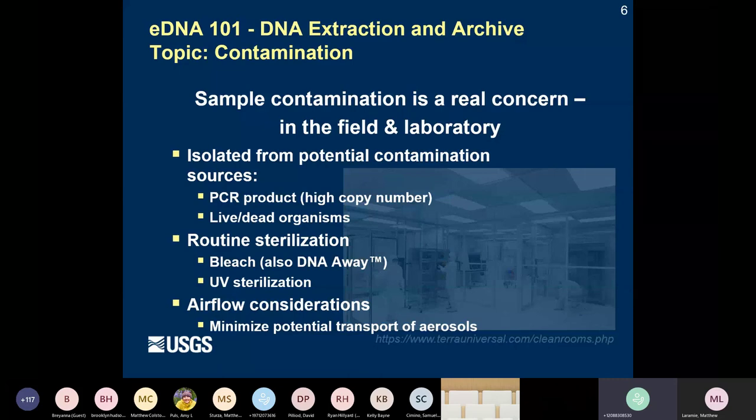So if your study is involving fish, I'm not going to recommend that this work be carried out in some lab space you might have available in a fish pathology lab where you're going to routinely handle these target organisms, or in a facility that houses both a hatchery and a lab. Those are both going to be far from ideal for this purpose. So right away you might be thinking that this stage of the workflow might not be appropriate for you. And if that's the case, that might be correct. This potential for contamination is pretty high, certainly if you were to ignore most of these considerations. But in the right facility, we found that these risks can be significantly minimized and managed, so that in most cases, they can even become mostly just a non-issue.